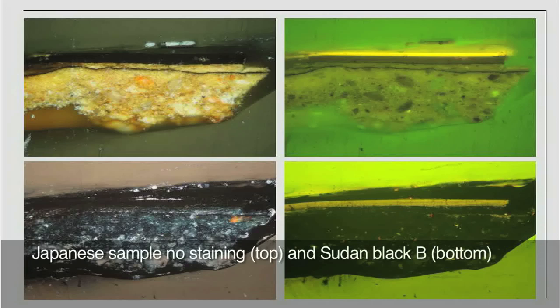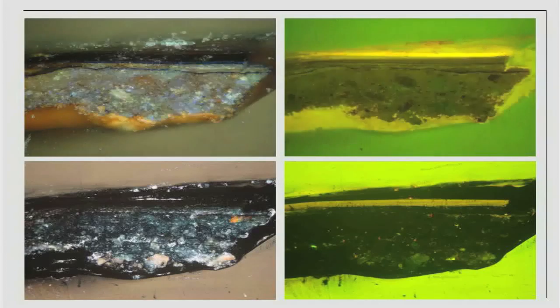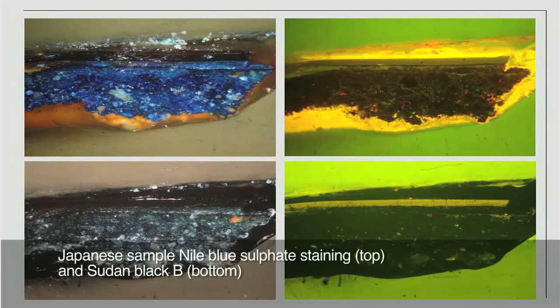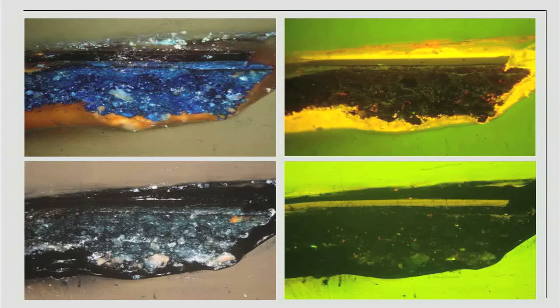Here is the Japanese lacquer sample as shown before without staining and stained with Sudan Black. If the top row is replaced by images taken after Nile Blue Sulfate staining, it is clearly visible that the Nile Blue gives a similar result to the Sudan Black, but without interfering with the coating agent as much as the Sudan Black did. However, it should be noted that the top coating of the sample does also not appear to be stained by the Nile Blue Sulfate.